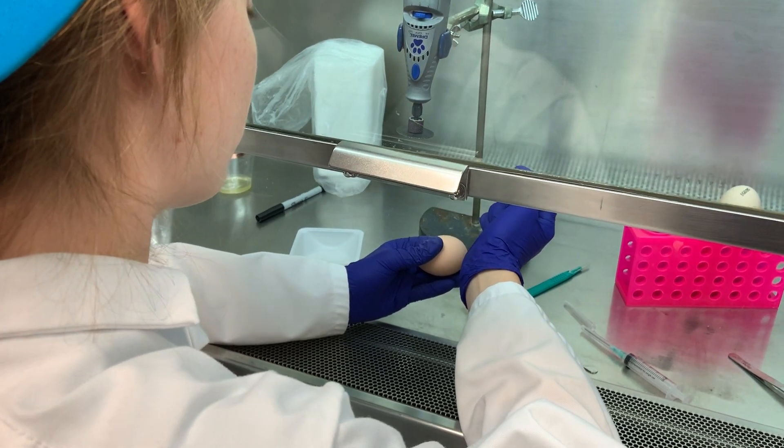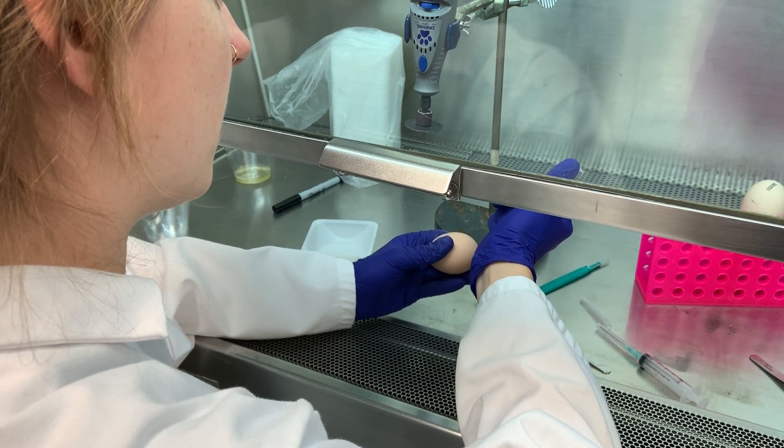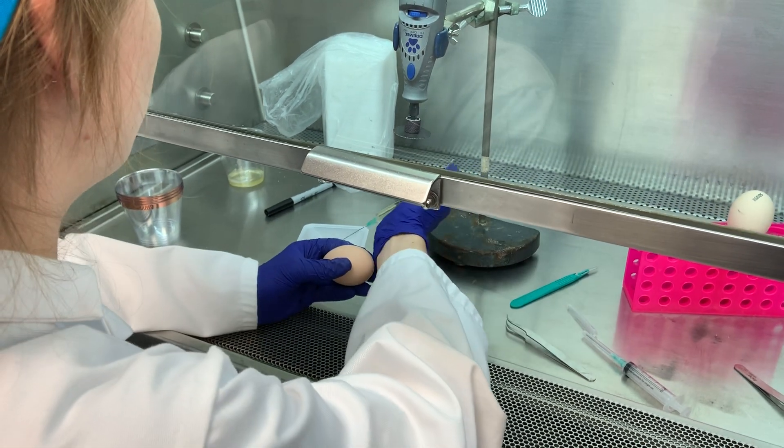So you're sliding that needle down, along the eggshell — correct? Yeah, so that doesn't hurt the yolk. That's why we tilt it too, so the yolk rides to the top.